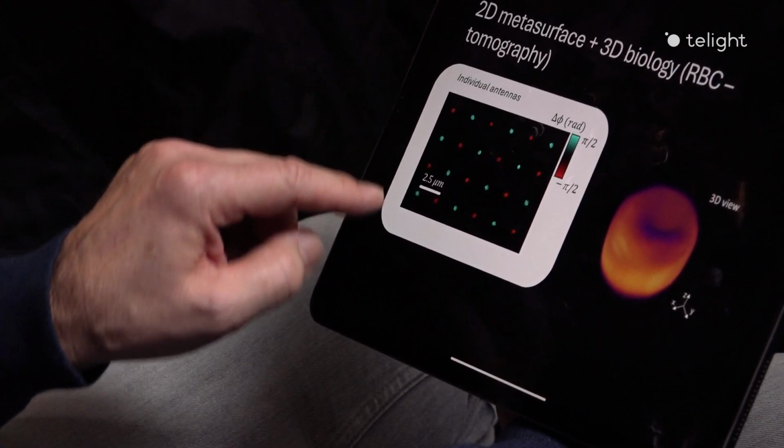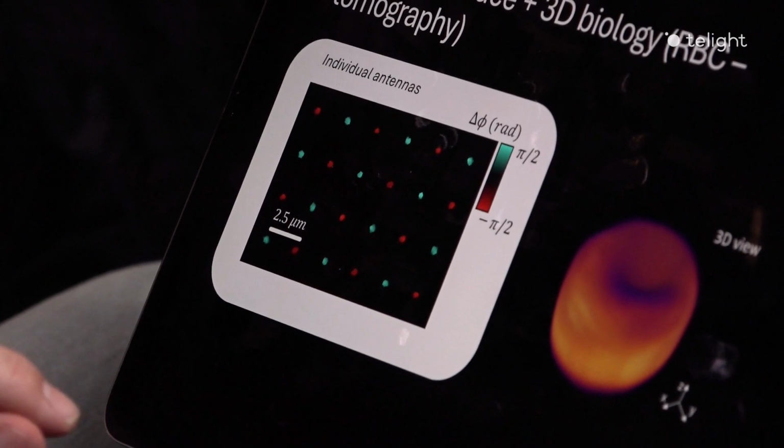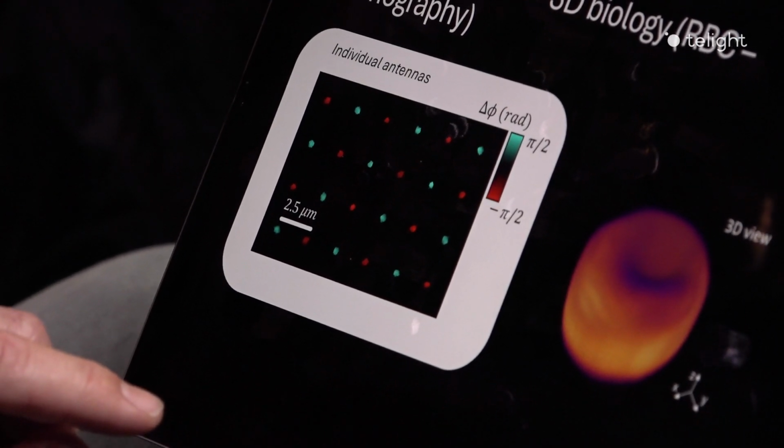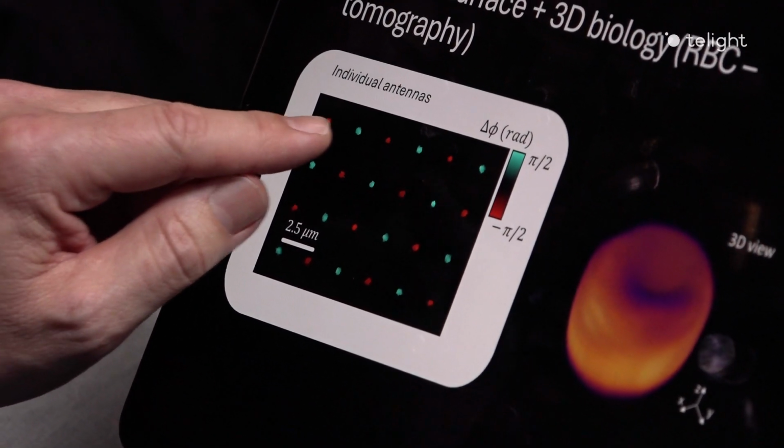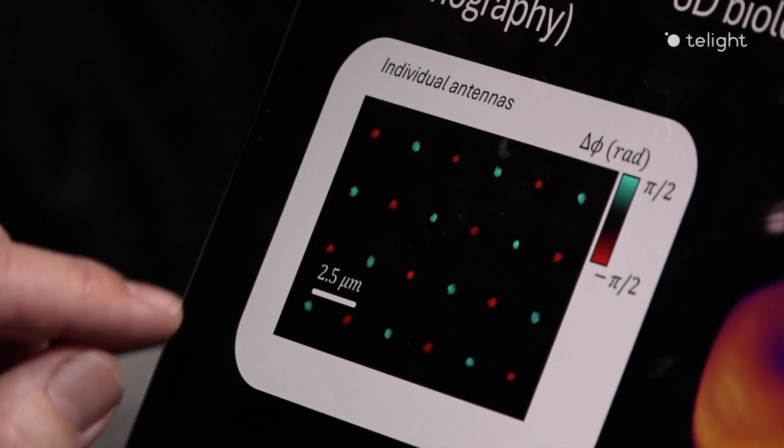Can you describe this image that we see here that came from the Q-phase system? In this picture, you can see the Q-phase observation of an array of plasmonic nano-antennas, which can serve as building blocks of metasurface optical elements. Q-phase gives us the possibility to observe individual plasmonic nano-antennas and to measure the phase shift.